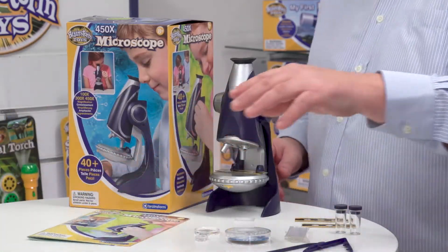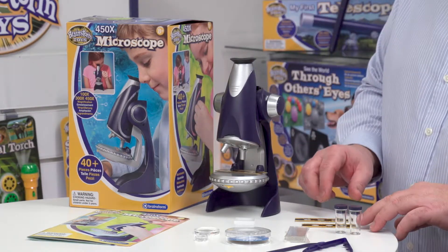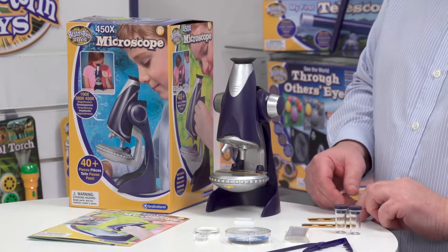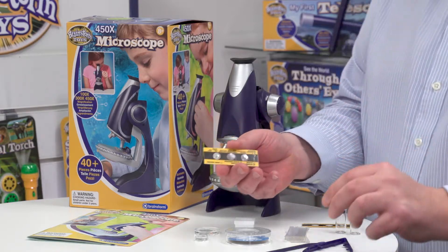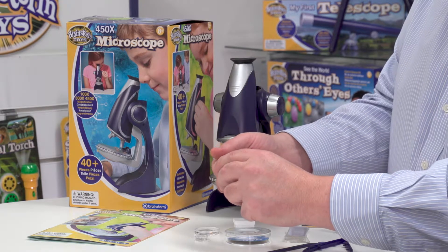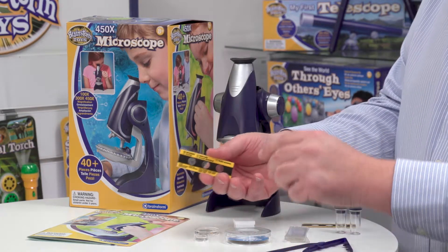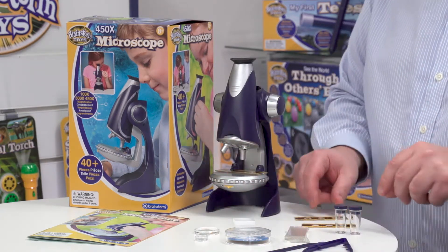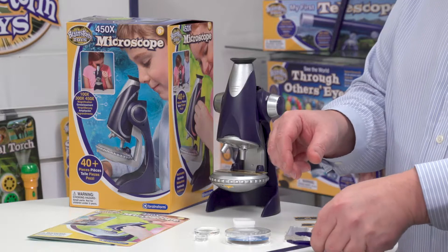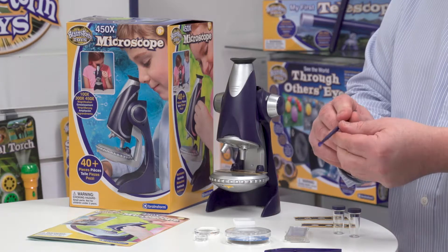We've got the microscope itself which I'll come back to. We also have three sets of pre-prepared slides — nine samples in total. Looking at this one here, it's got algae, it's got lava, and it's also got some green seaweed. Then over here we've got some little vials for collecting samples, some tweezers to help you handle them, and there's also a little scoop for scooping things up and putting them into your vial.